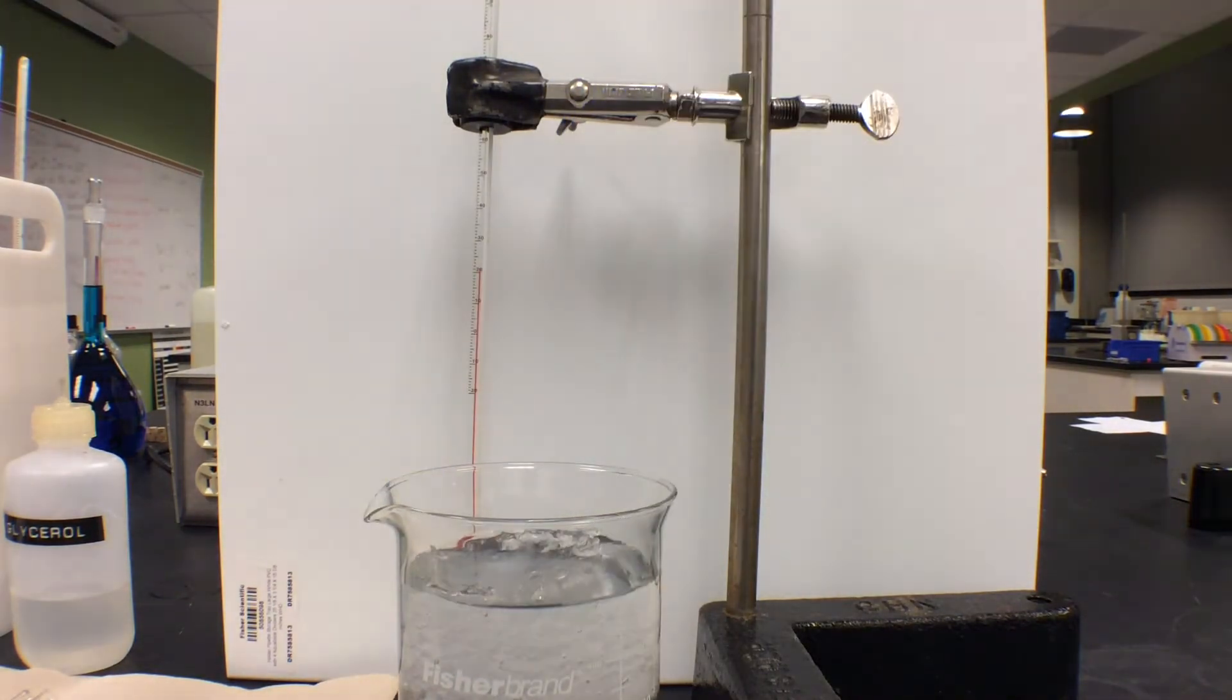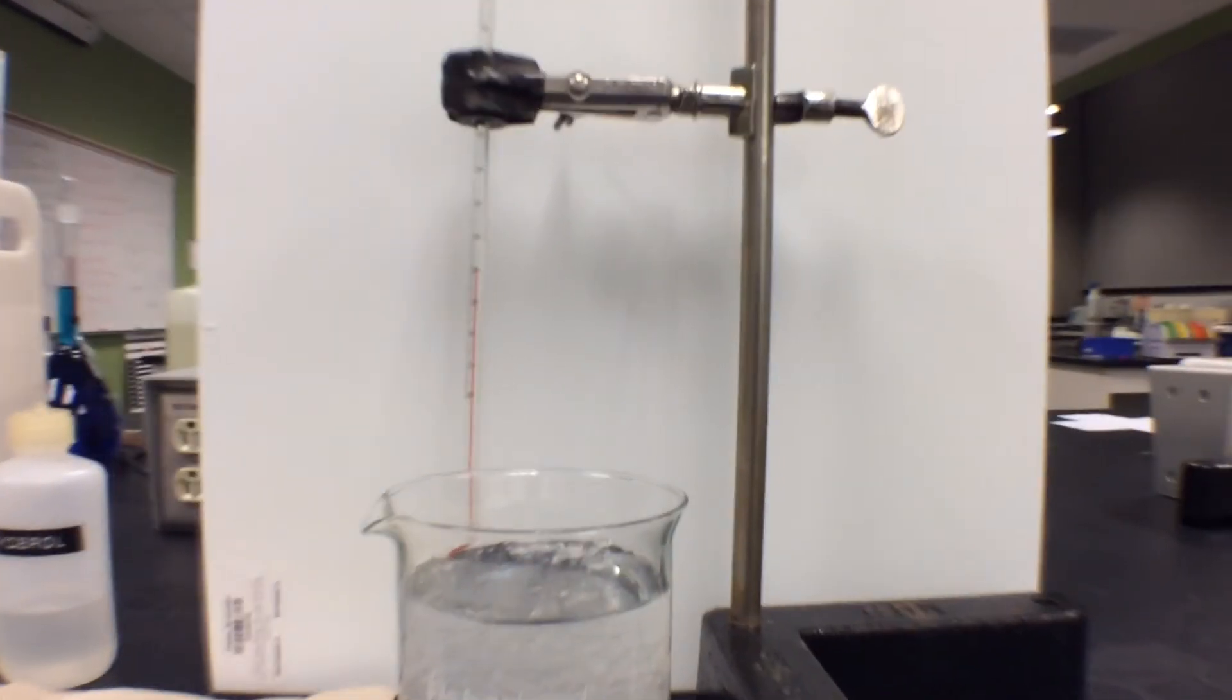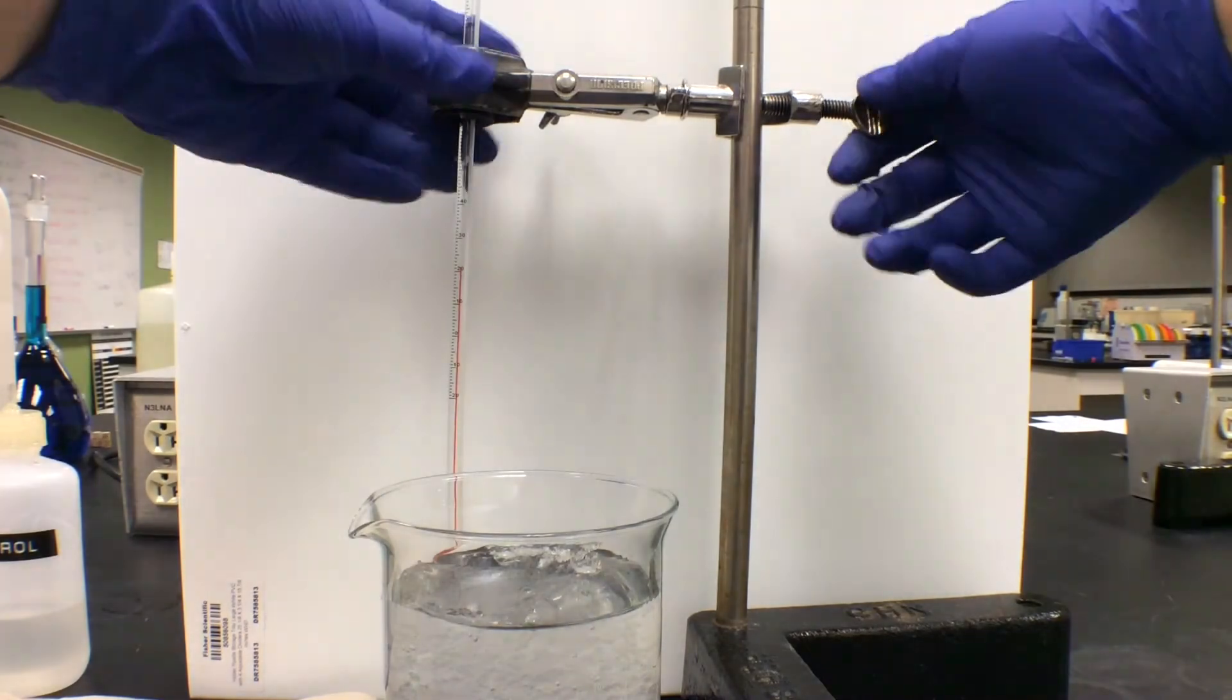Next, calibrate the thermometer with an ice bath. An ice bath is made with ice and deionized water in a large beaker.